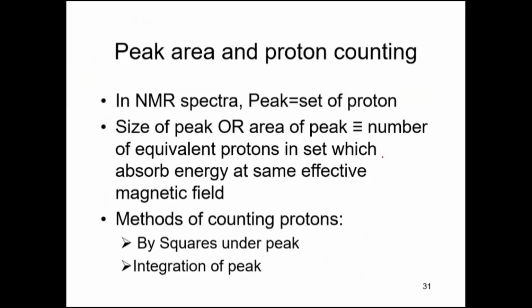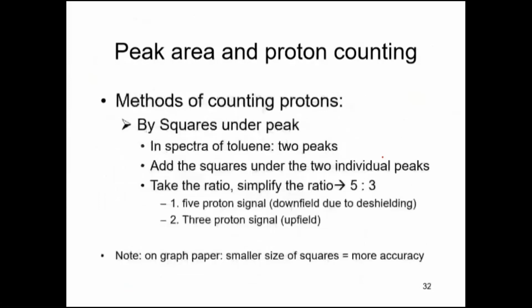Then there are two methods of counting protons. One is counting squares under the peak, and the second is integration of the peak. Now let us start with the first method, counting squares under the peak.